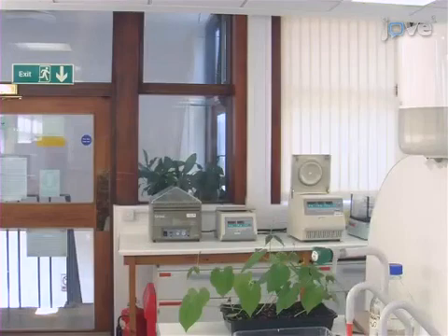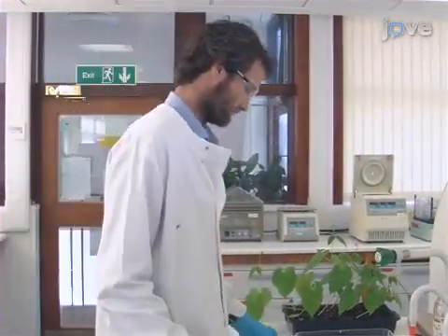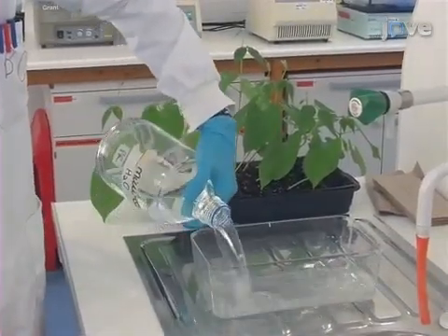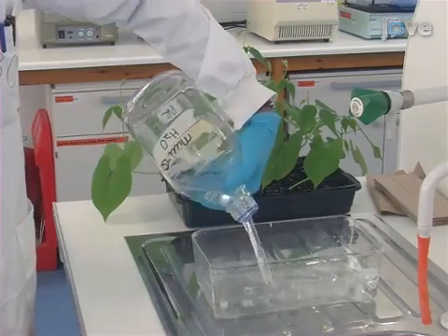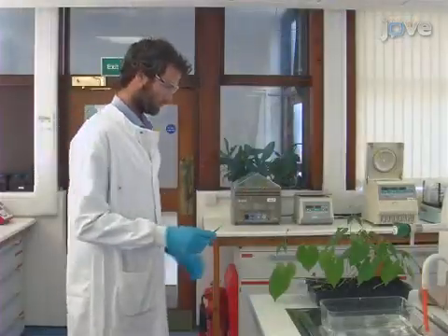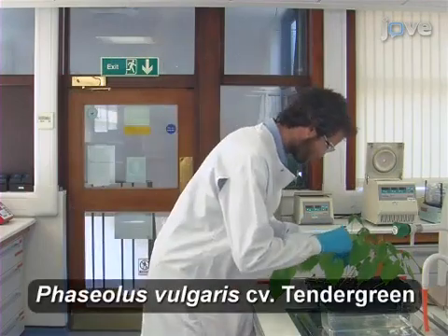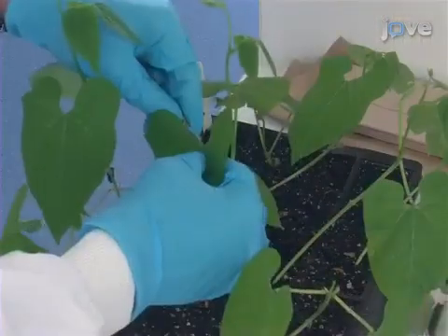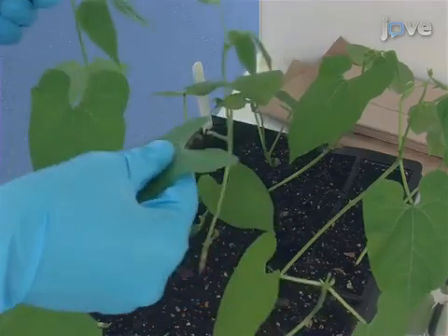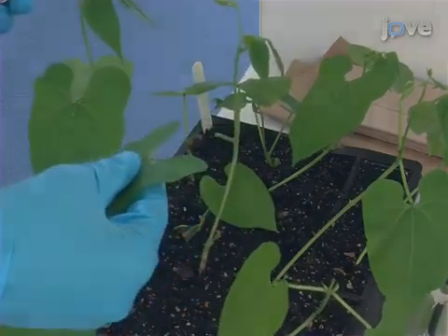As a first step, take safety precautions by wearing a lab coat, gloves, and goggles. Next, prepare a volume of distilled water in which to immerse the leaf sample. Have a razor blade ready to collect a sample — in this case, a leaf from the bean cultivar Tender Green. Place the razor blade against the petiole of a leaf and detach the leaf from the plant.